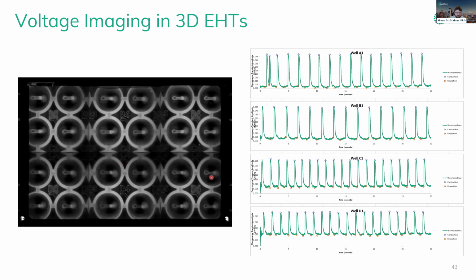There we go. It's worth noting that these changes are much smaller than the calcium changes that I showed before. In the videos I showed previously, the calcium changes were pretty visible, even just watching the video. If you look very closely, you can see some of those changes here in the video. And we can see in the graphs the changes clearly, but at a much smaller amplitude.